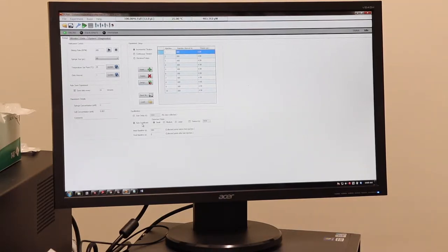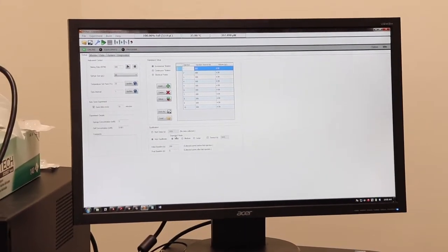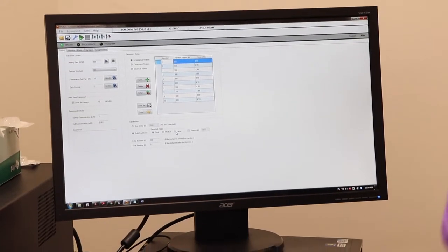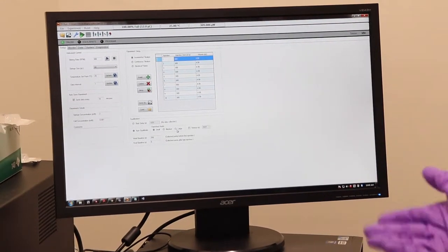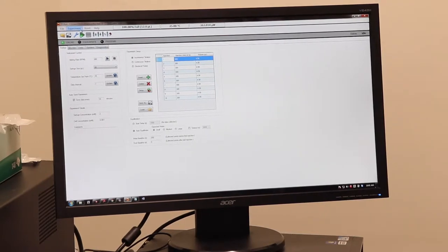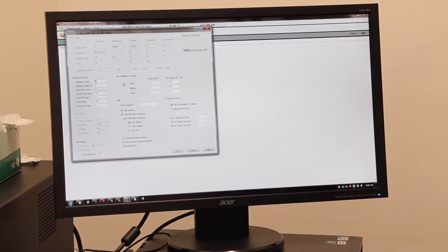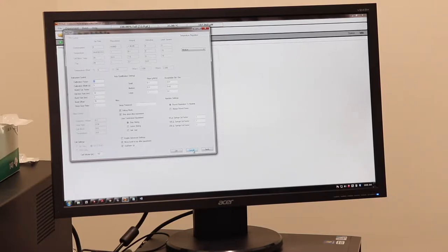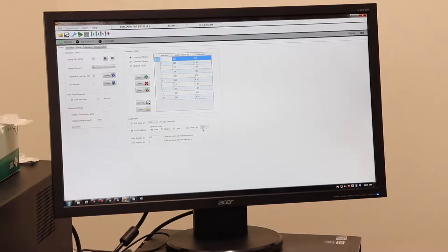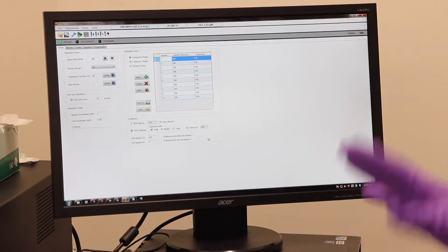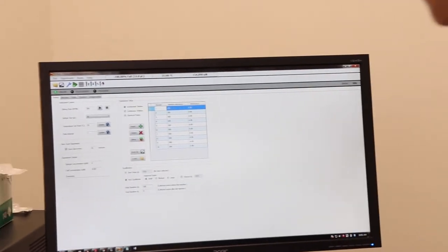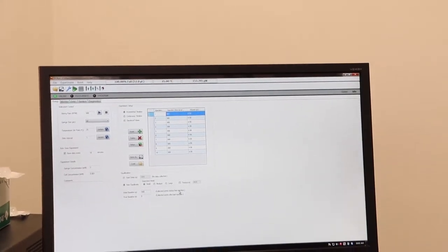Another thing we'll look at here is the auto-equilibration, which we'll watch in a few minutes. And you can set either small, medium, or large expected heats. That's basically, once you start it, it's going to wait until there's a nice baseline before it starts the injection so you have a good baseline during the experiment itself. So your analysis will be easier. And these small, medium, large are just arbitrary values that are set in the settings here based on what kind of heat you expect. So for water-water, we're going to leave it at small. There's a timeout function here that, you know, timeout after an hour of auto-equilibration. I usually leave that off because sometimes it's really close at that hour. And then if it shuts down, you're going to start all the way over. And you want to have an initial baseline here of 300 seconds. And that's going to allow you to get a nice baseline before that first injection.